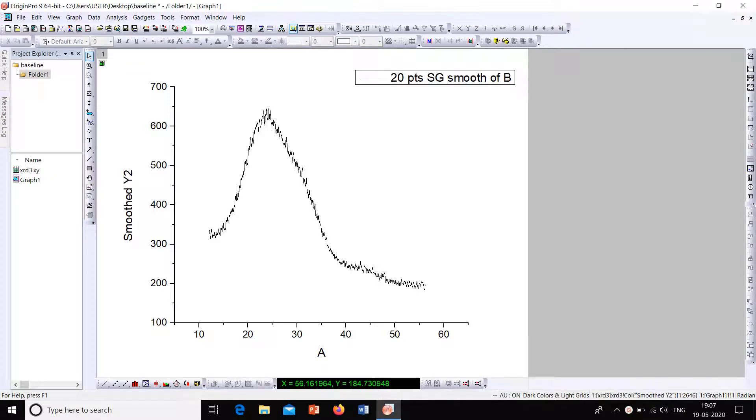Hi friends, in this video we will see how to create and subtract baselines for graphs.